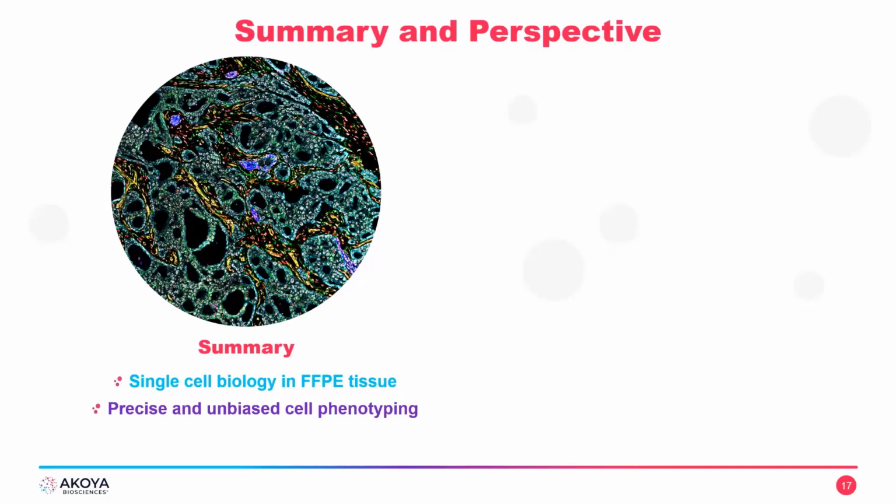Every result that I've shown you today recapitulated another result elsewhere. This was done by accident. We didn't plan to do that, but the results are strikingly similar. Every result that I've gotten today was reached after unbiased data analysis. I had no preconceived ideas about this tissue. I just let the data guide me to where I am today. Finally, and probably most importantly, single cell spatial resolution was maintained throughout this entire journey.